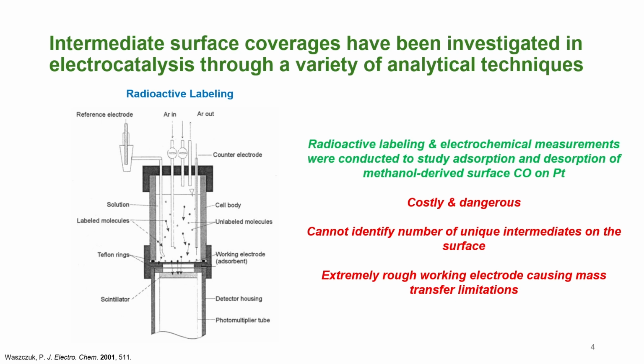This is a technique known as radioactive labeling, where essentially you can monitor the surface in order to understand what's adsorbed onto it. Essentially, your reactant is a radioisotope. In this example, this is a C14 labeled methanol. This reactant will adsorb to the surface, and these radioisotopes actually emit what's known as a soft beta emission.